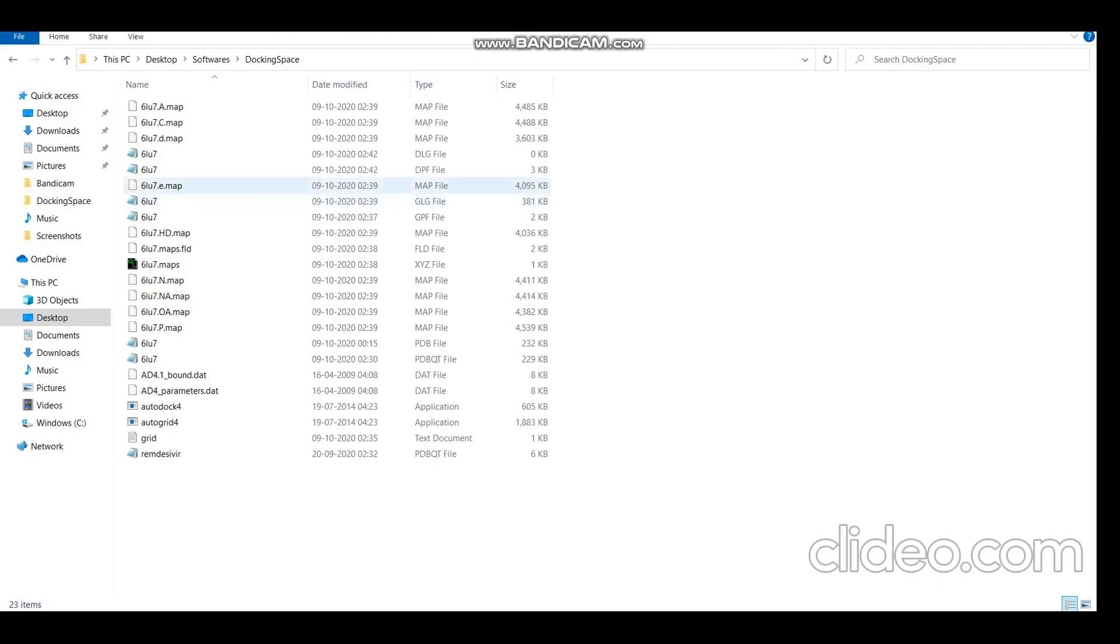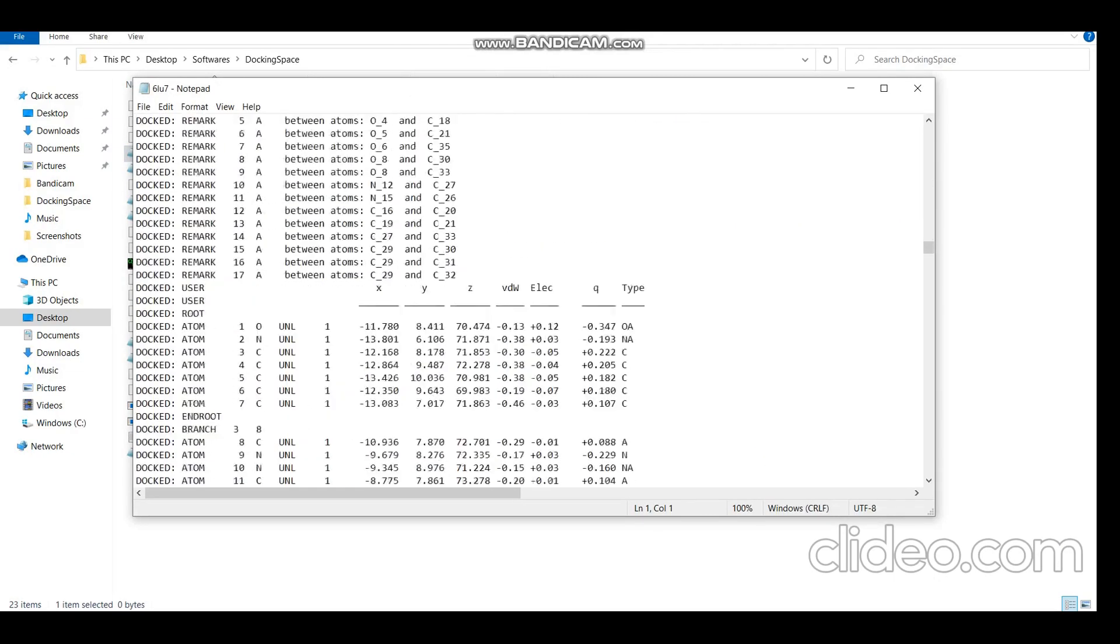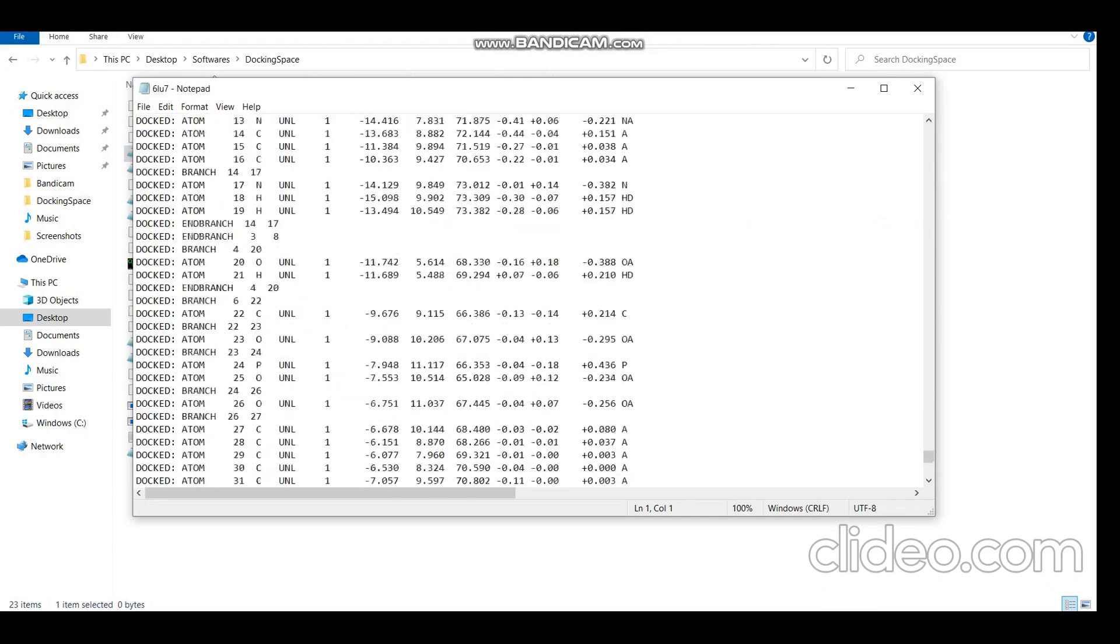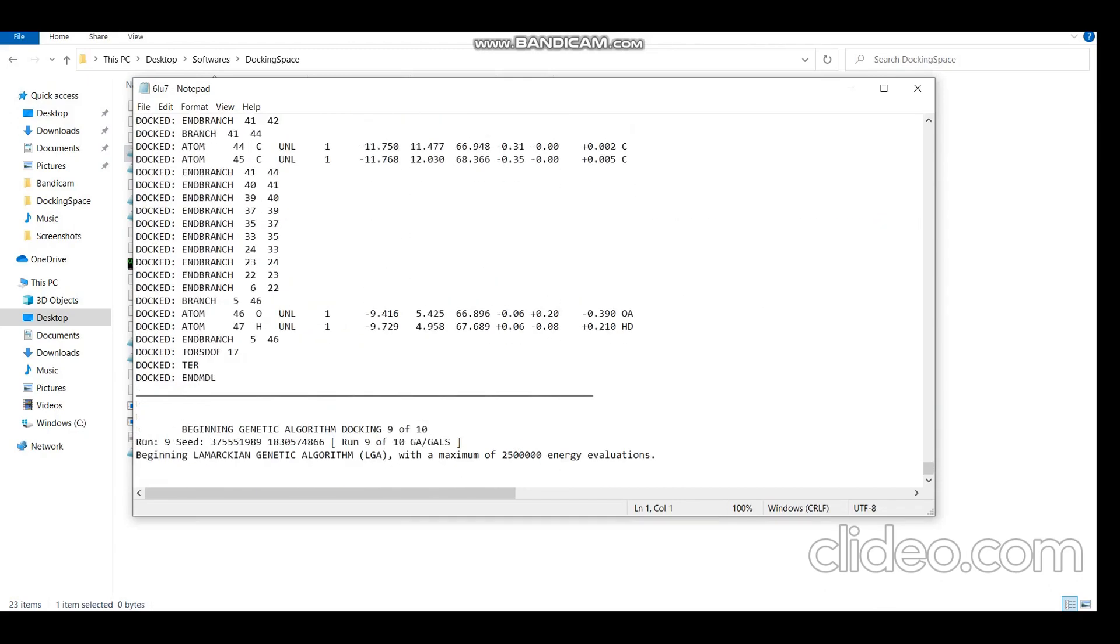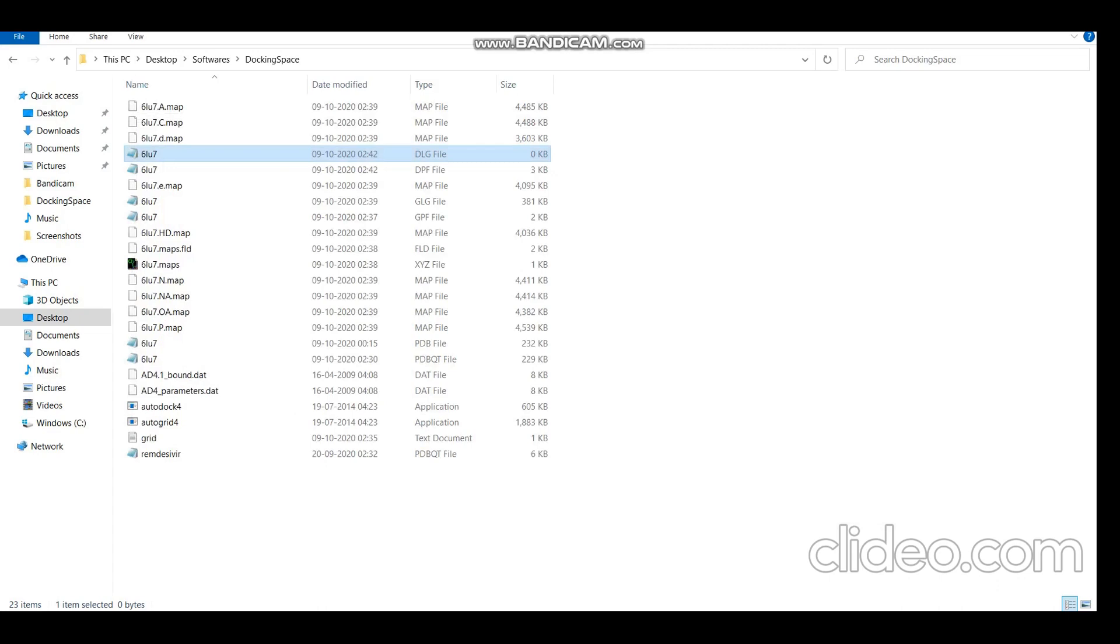We can see the DLG file generated here. Although the process is not completed yet, we can check the progress here. So now it is on the ninth round of docking. Just close it and get back to our docking window.